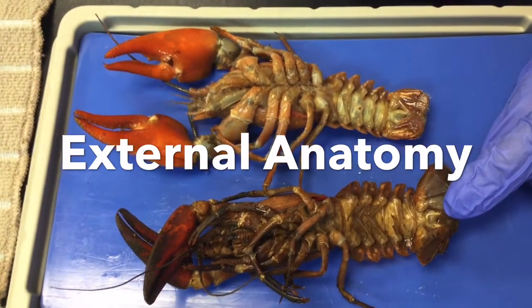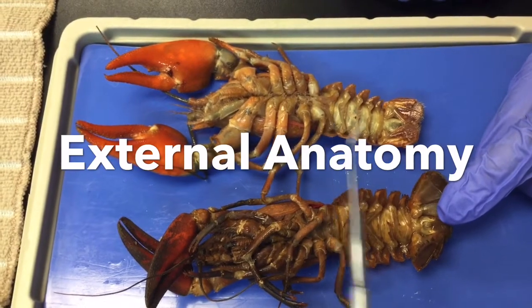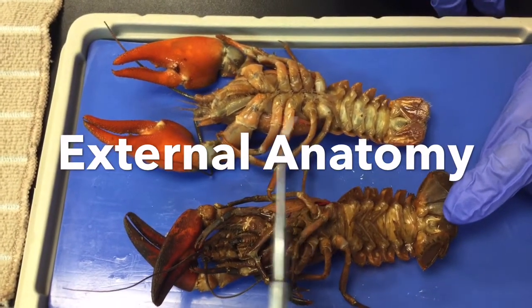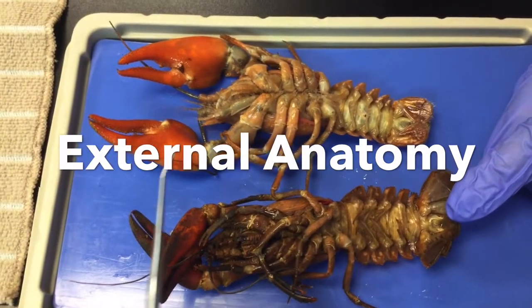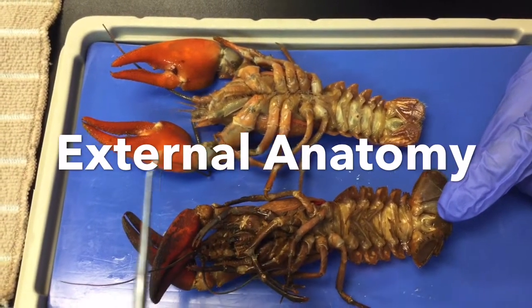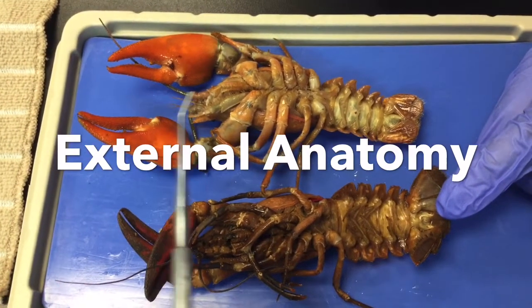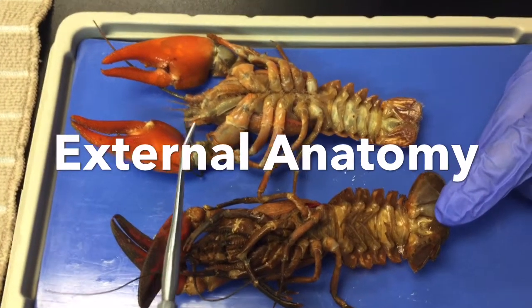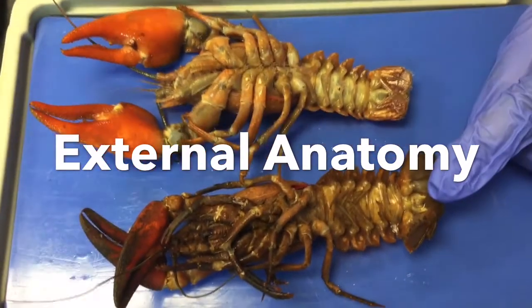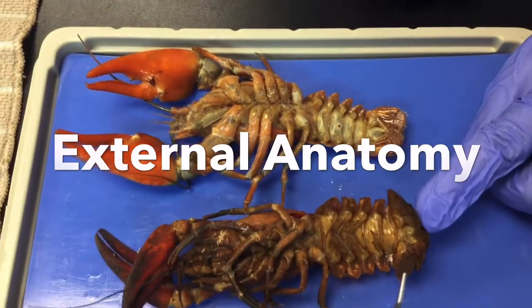Do we have a female or male? Well, we have one of each, female, male, and we know that because of the swimmerets. These are the walking legs, and remember what we call these? The chelipeds, yes, the claws. And we have two sets of antennae, the long ones and the little ones, the antennules. Okay, that's our start, external anatomy, and the little tail part called the uropod.